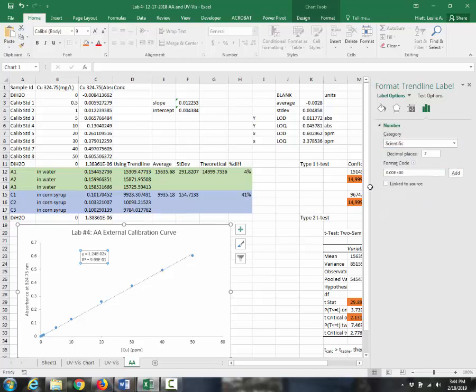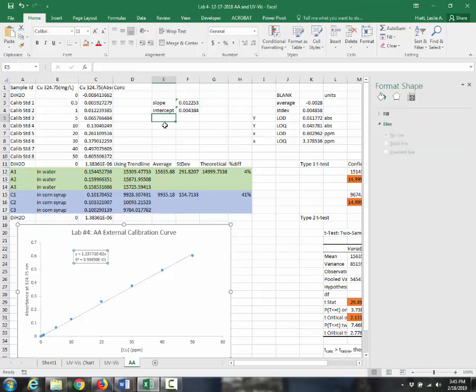So for instance, if I were to add a whole bunch more of my data points here, and this is my intercept, 1.23771 times 10 to the negative 2, if that is my slope, and I'm assuming 0 is my intercept, then whenever I calculated this, which is simply converting this row from absorbances into concentrations, you normally just use the trend line.